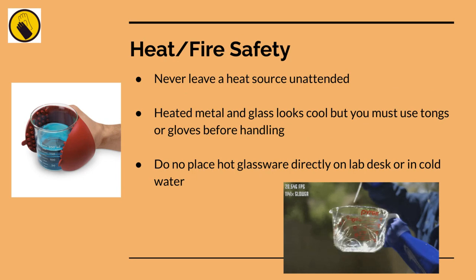So heat and fire safety, again, never leave a heat source unattended. Heated metal and glass looks cool, but you must use tongs or gloves to handle it, or else obviously you're going to burn yourself, which is not cool. Do not place hot glassware directly on the lab desk or in cold water. As you can see from this little gif down here from Slow Mo Bros, this is why. That's a superheated Pyrex glass, and what they're doing there is squirting a little bit of cold water into that superheated Pyrex, and that's what happens.